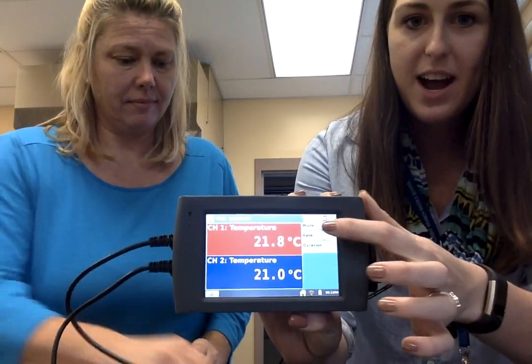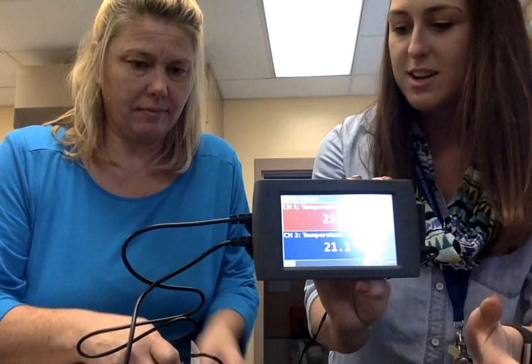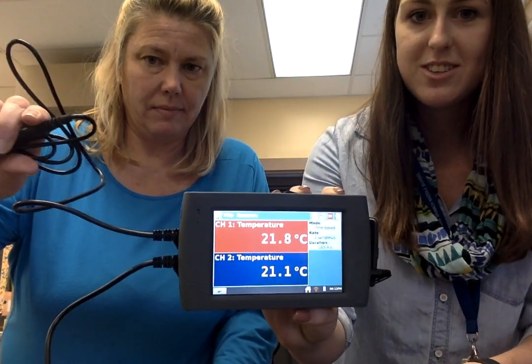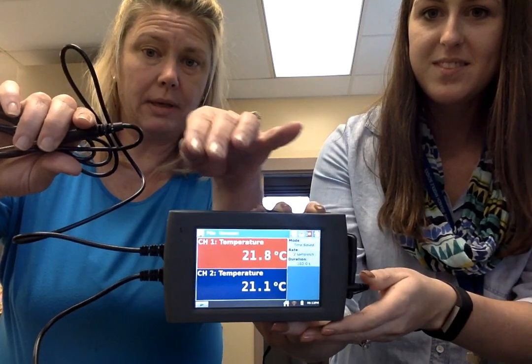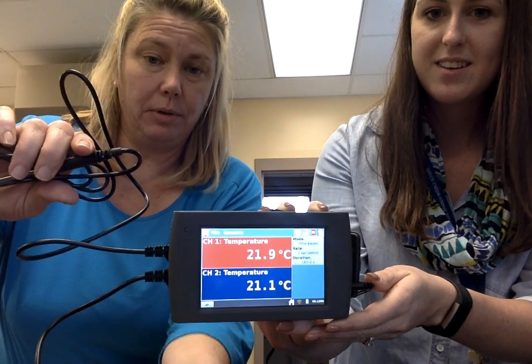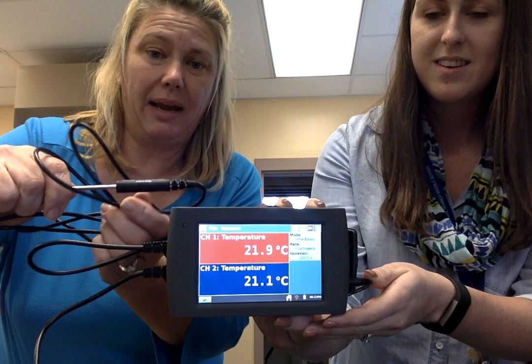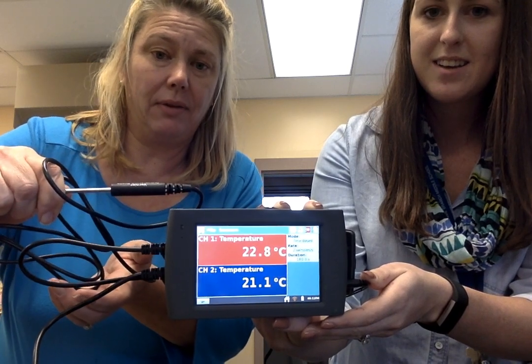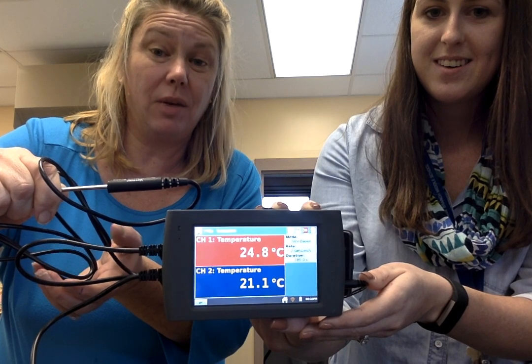Now that the Vernier is up, you can see that you have the temperature probes starting to measure changes in temperature. It has two probes — the top probe is connected to the red bar, and the bottom probe is connected to the blue bar. I'm going to hold this temperature sensor in my hand — you see how the numbers go up? That's how you know it's working.